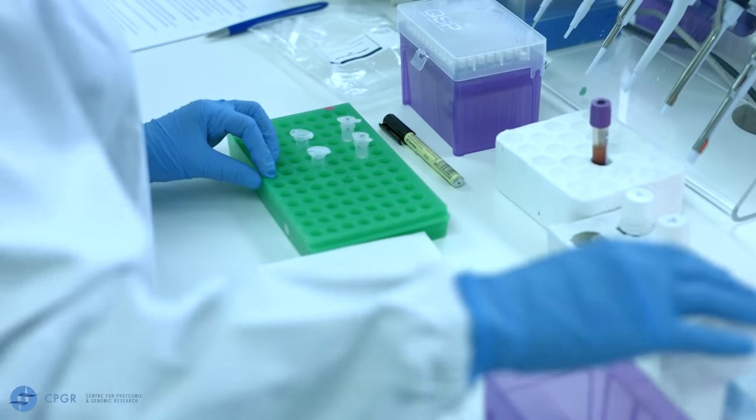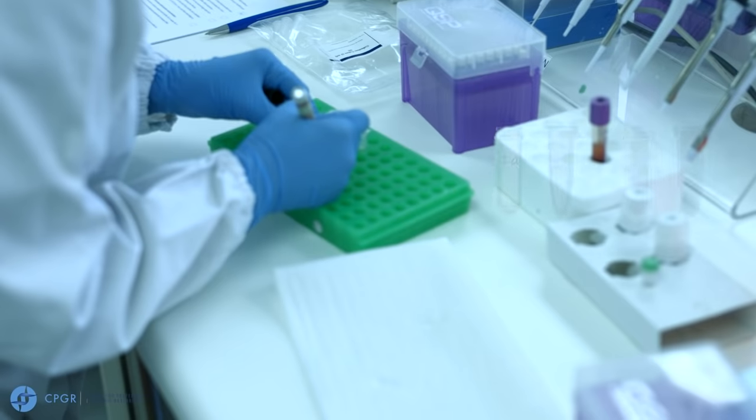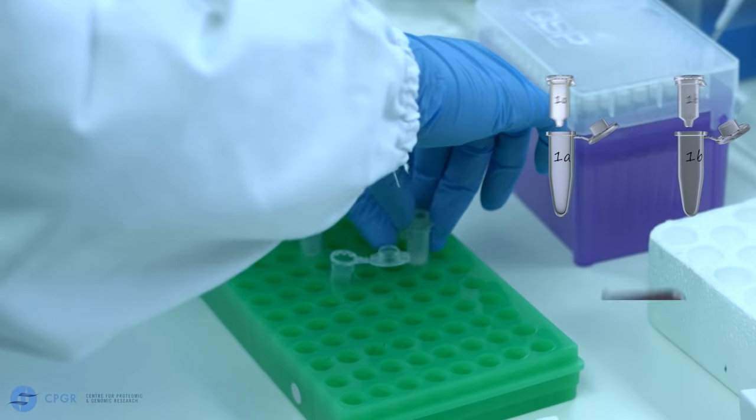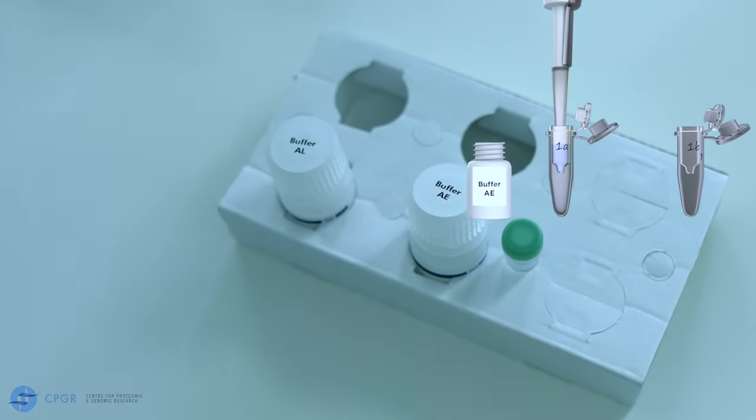Label clean 1.5 mil microtubes, one for each sample, and transfer the spin columns to each corresponding microtube. The DNA that was on the spin column will be eluted from the column to the AE buffer.